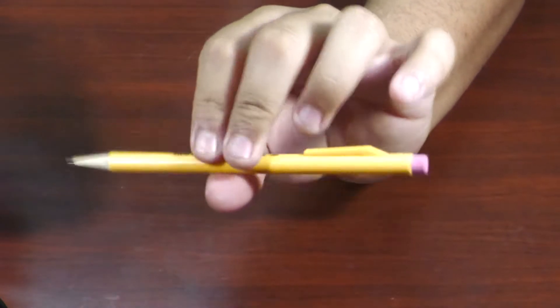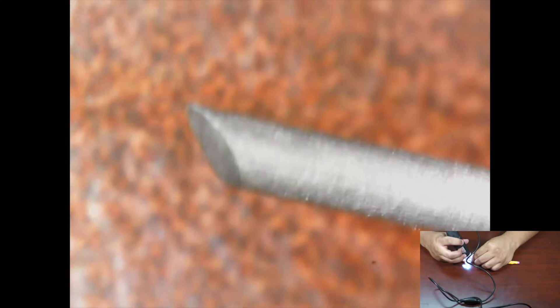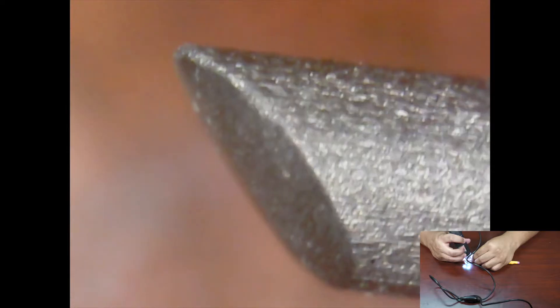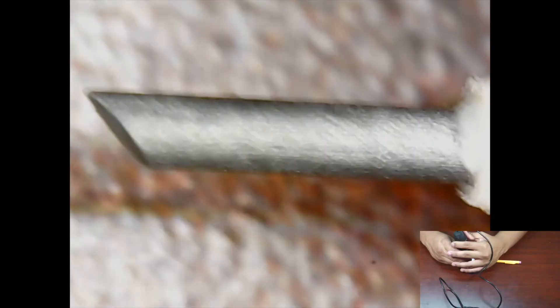The next thing is gonna be this mechanical pencil. Whoa, it kind of looks like a piece of steel, like a piece of metal. Let's see if we can zoom in even closer. And there you have it — the tip of this mechanical pencil. It kind of looks like metal, like a steel pipe. I like how the break in the pencil is nice and clean. There you go, that looks perfect in the camera.